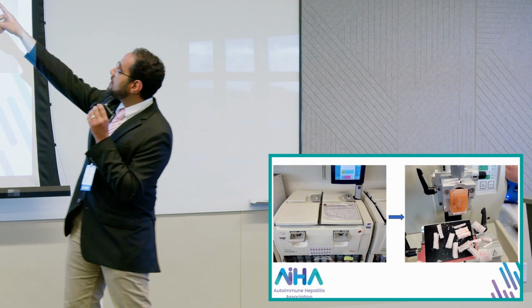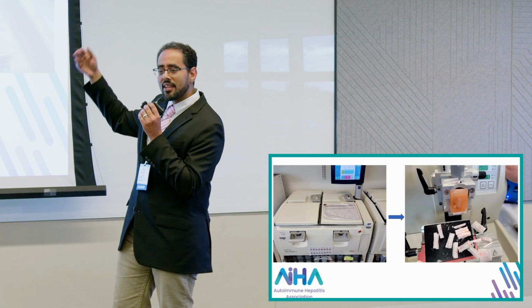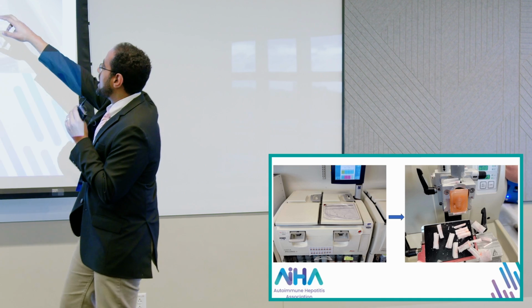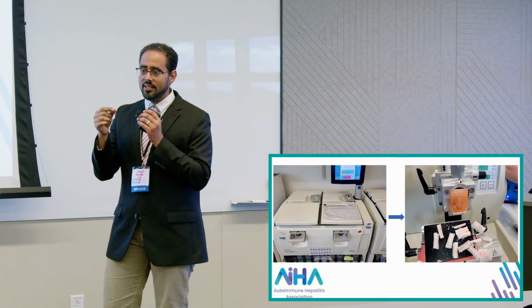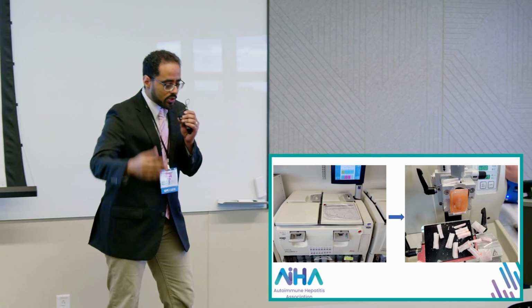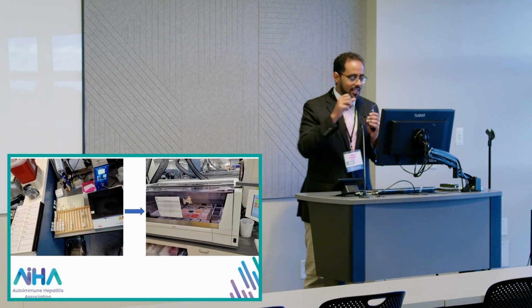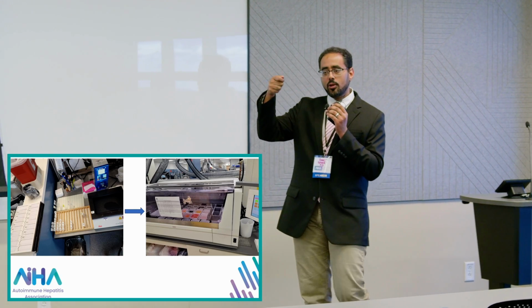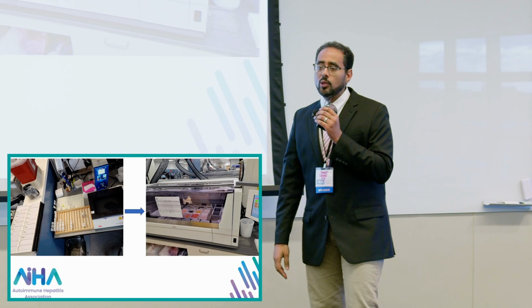Then it comes to this device. It's just like when you go to the deli store and they cut the meat into slices. This cut is very thin, not like that one, but that's the simplest analogy. It is called a microtome. It has a blade in here, and it cuts very thin sections, 4 microns. A histotechnologist does that for us. Then they cut it thin, and it goes into what we call a water bath. Then they pick it up with a very thin glass slide. And then it's just a transparent, waxy piece of tissue, not helpful to look at under the microscope.